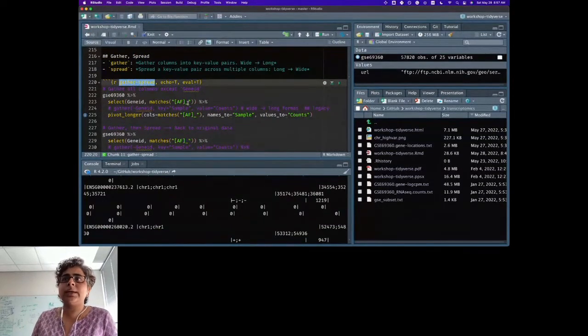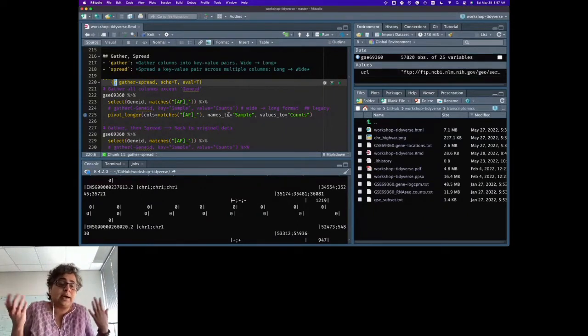By the way, here is where I'm naming the chunk. I'm saying that this code chunk is in R. Actually, you can even say Python here, because you can use Python or any of your other programming languages within the chunks. I'm just using R.